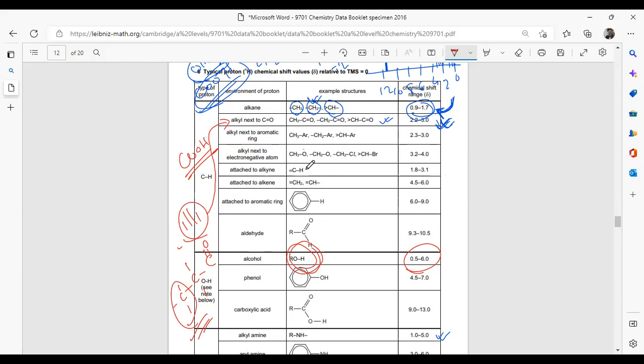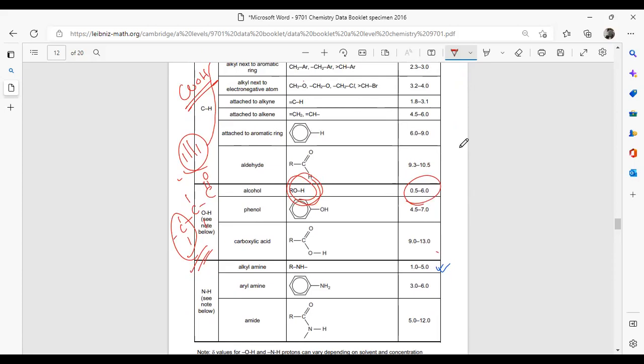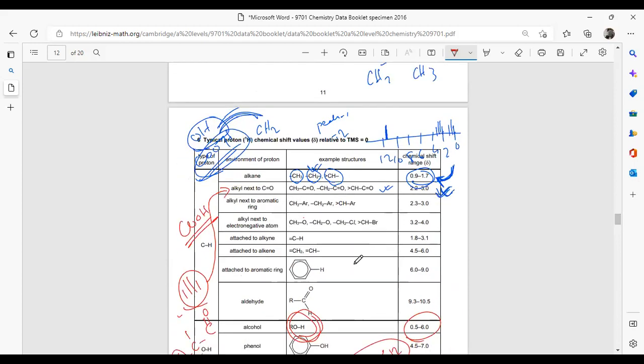So that's one possibility. Now let's see for carboxylic acid. We have OH here. Here we have a carboxylic acid, so this defines it much more; this is much more feasible. See, within that region, more than 11, less than 12, which is in between 9 and 13. That means this graph actually represents carboxylic acid much better.